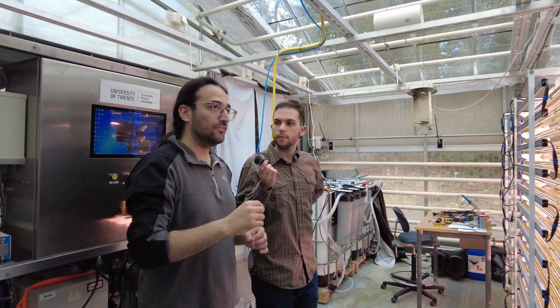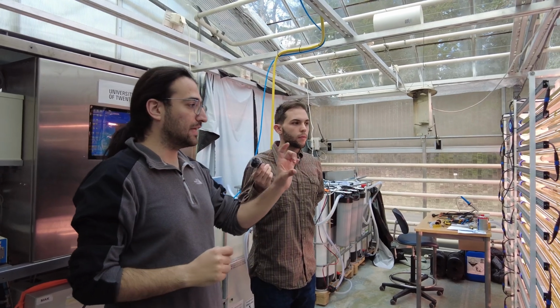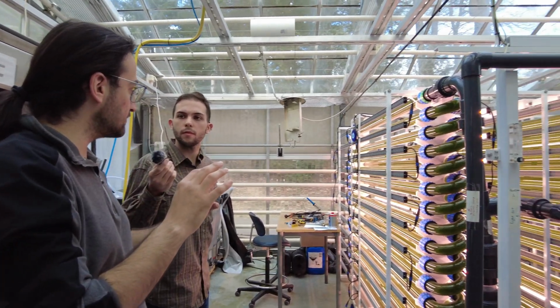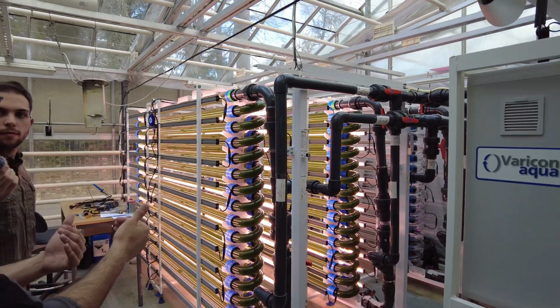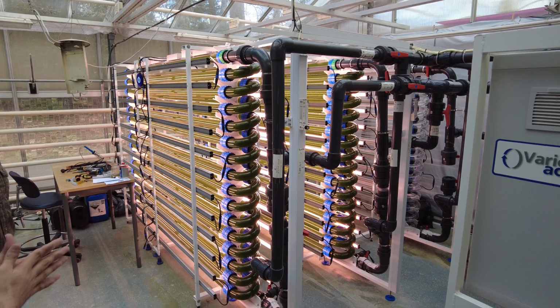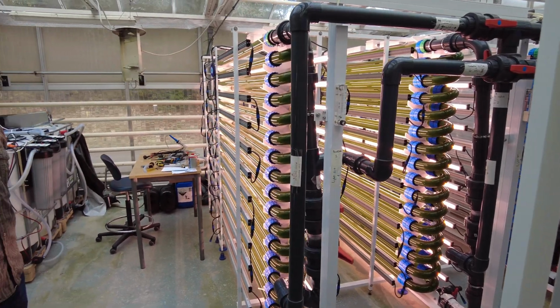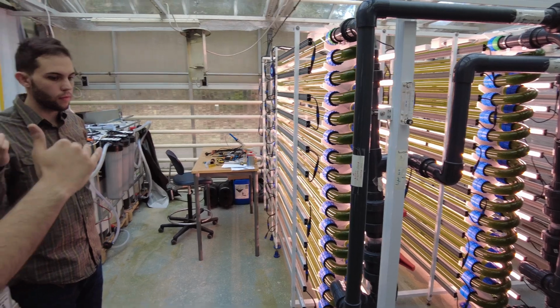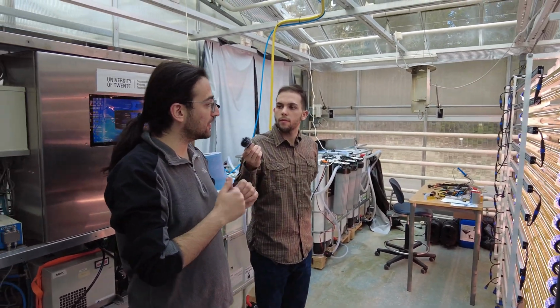And every day we have on-site probes, and we are taking a sample and measuring lots of variables at the lab to understand how fast our algae are growing and how fast we are treating the wastewater. So what is our nutrient uptake performance in this sense? When the time comes, it's time to harvest our algae and actually the treated wastewater.